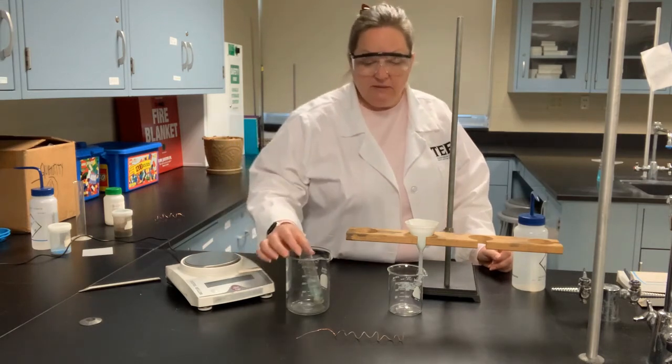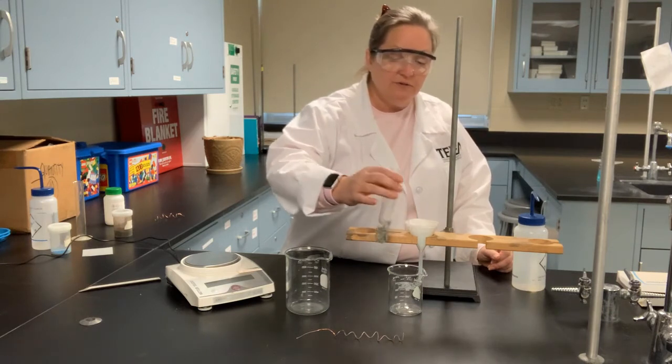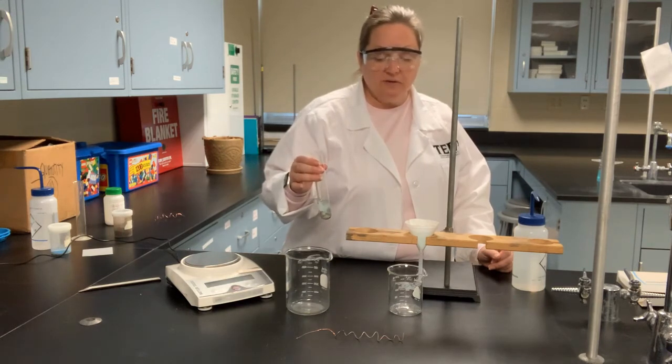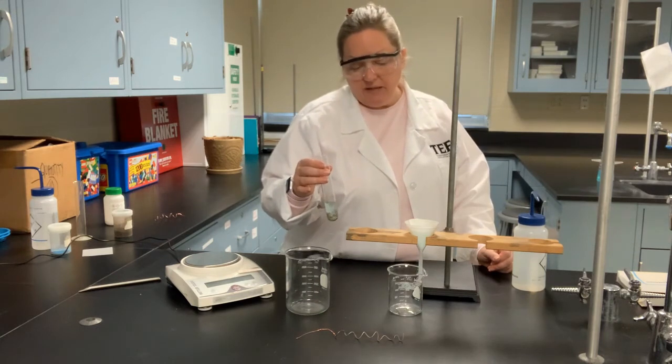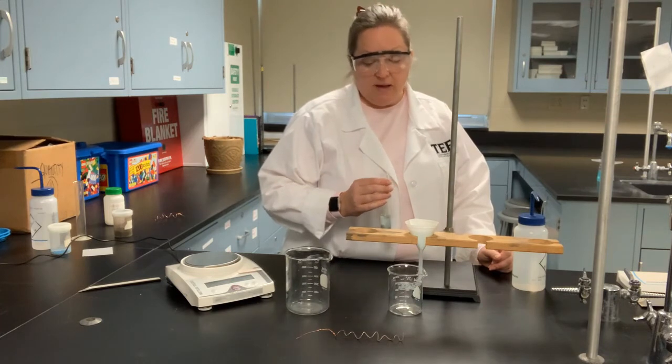And then once that runs down a bit, I'll go ahead and continue to pour off the solution. This is often referred to as decanting. In this particular case, it doesn't filter so slowly that I would need to decant some of this off in advance of filtering. I can be patient and wait for it to filter off. You can see we're already getting a pretty good puddle there in the bottom of the beaker.